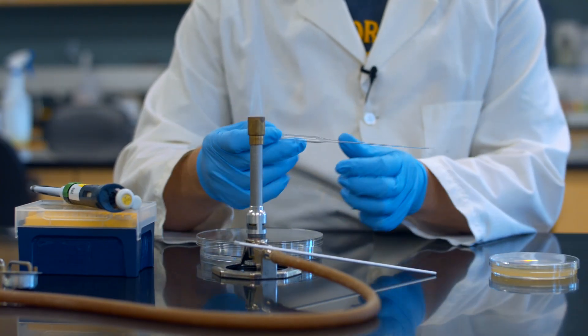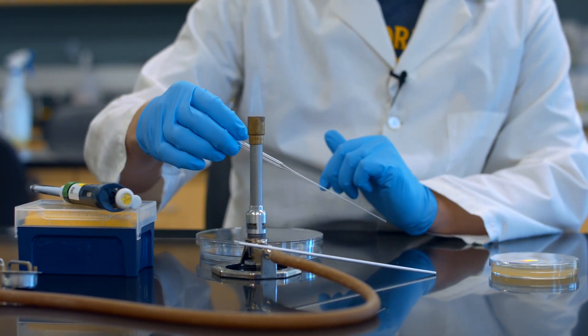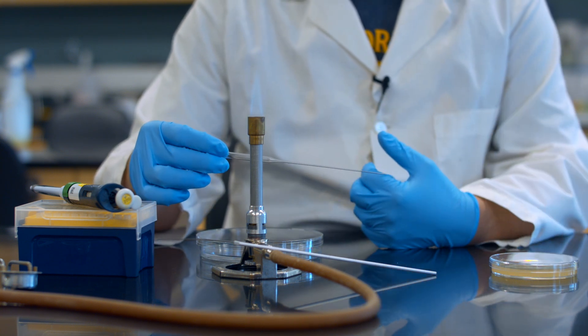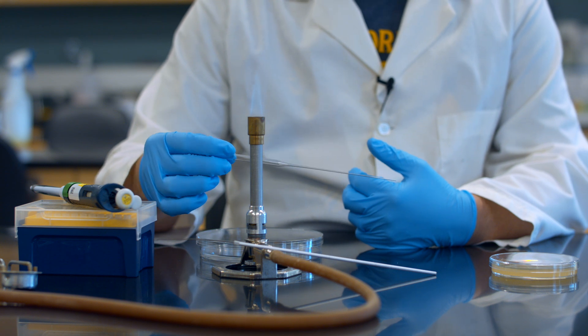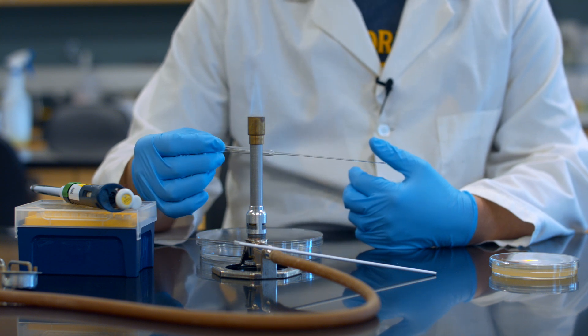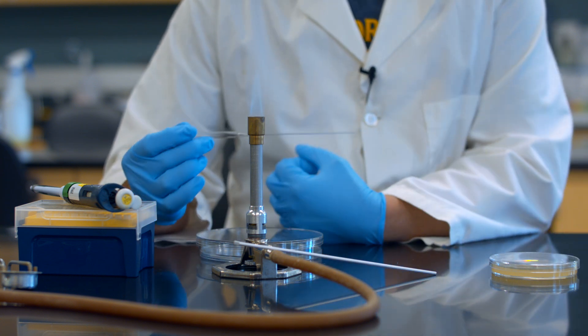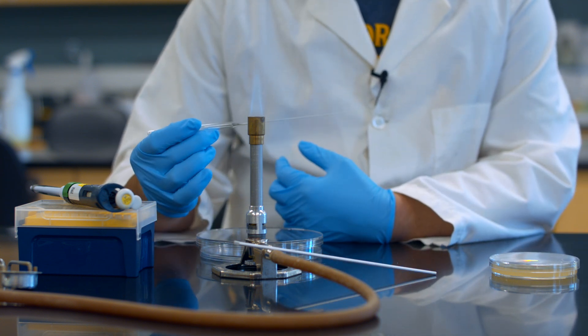Now the spreader we're going to make from a piece of glass. You can buy plastic spreaders, you can make heavy glass spreaders that you can keep around for a long time. I find that using these glass Pasteur pipettes is the most effective way to create a spreader. So the first thing I want to do is teach you how to make a glass spreader with a Pasteur pipette.